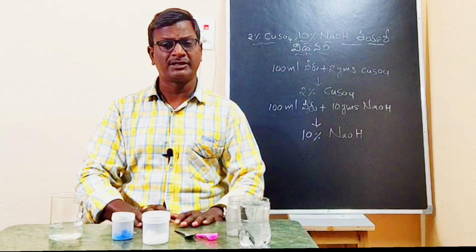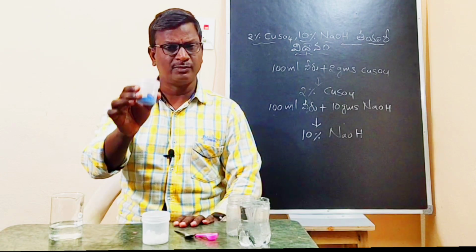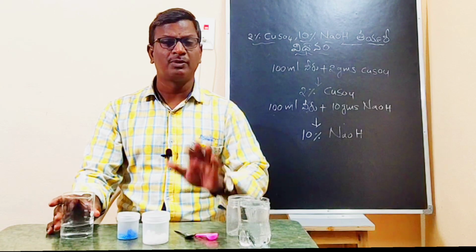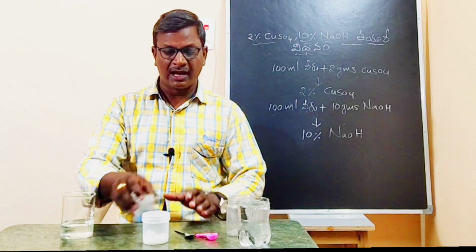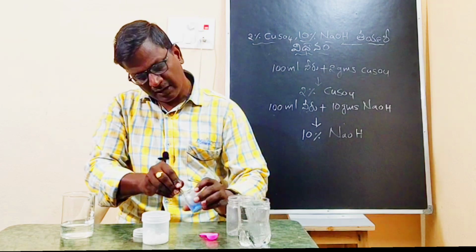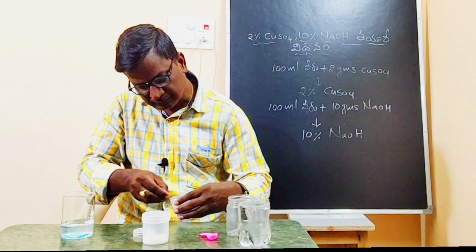How to prepare 2% copper sulphate? 2 grams of copper sulphate should be dissolved in 100 ml of water. This gives 2% copper sulphate. I am taking 2 grams of copper sulphate. Approximately I am taking 2 grams of copper sulphate.